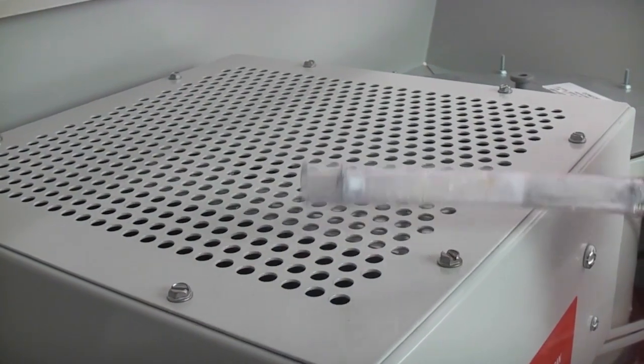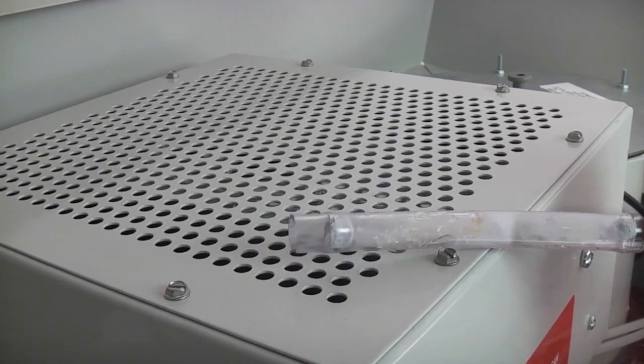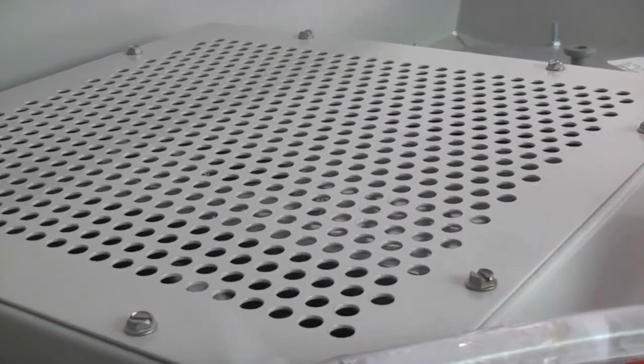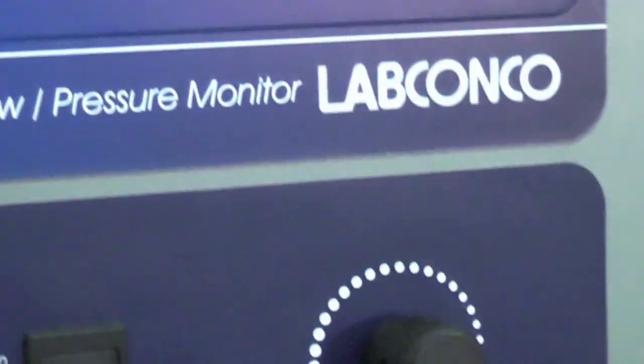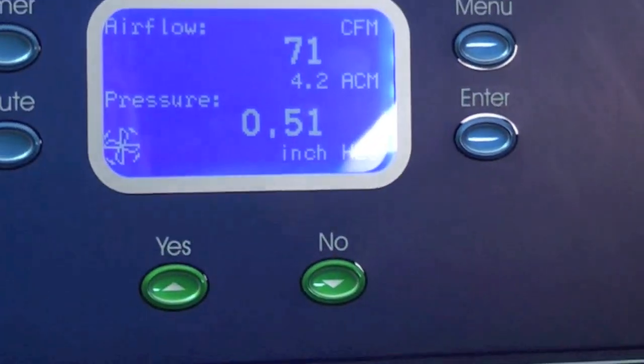These ventilated glove boxes include built-in variable speed blowers capable of air flows from 15 to 85 CFM. Adjustable air flow speeds make working with fine powders easier.